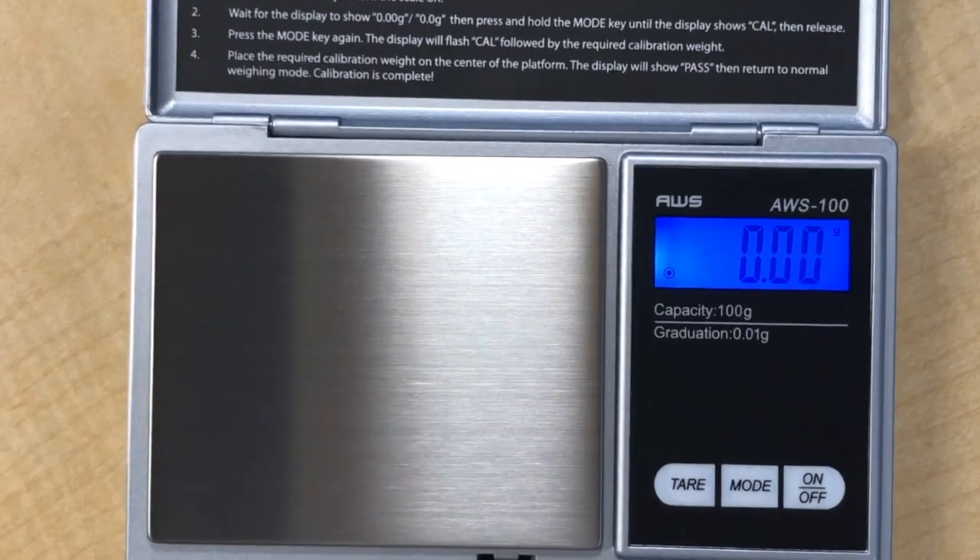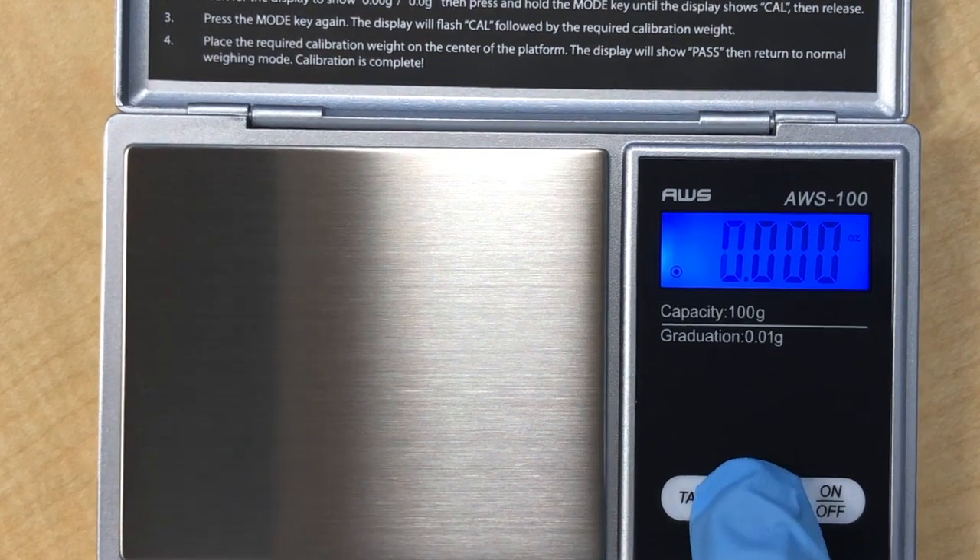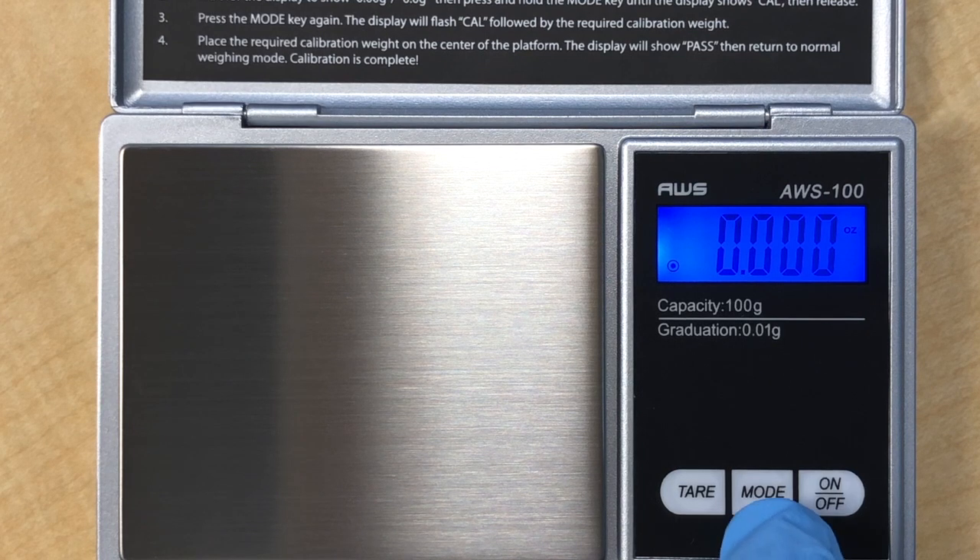Welcome to lab 5: Mole Counting by Weighing. This is a preview of the procedure that you will be doing in this lab.